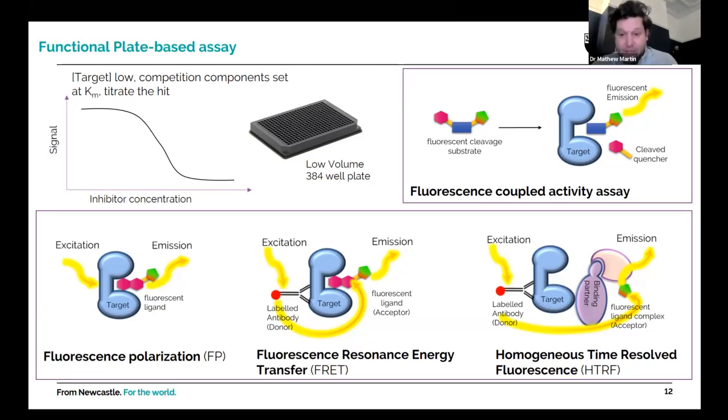As important as the signal you generate, of course, is how you control the assay. Having a known small molecule is obviously best, but in the world of going after novel targets it's not always available. So you should consider building a set of controls through point mutants on your target or substrate, for example, or other proteins that you may have to hand that could act as a negative control. Although we won't be touching on compounds at all in this talk, it's wise to point out that as the SAR campaign proceeds, compounds do get larger, and compound solubility and fluorescent interference should be accounted for.